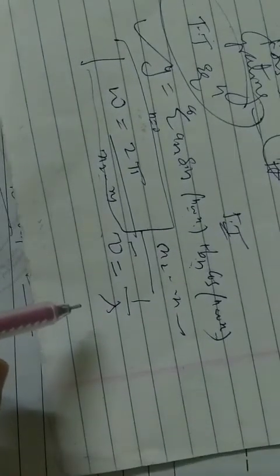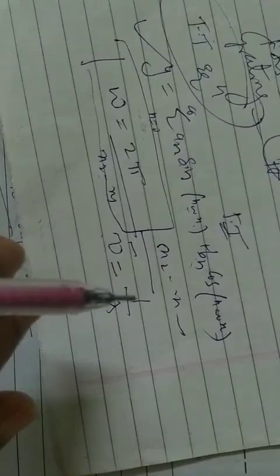So what is this omega? Omega is given by the formula 2 pi by x2 minus x1. Here x2 and x1 are the scale of the x-axis, which determines the resolution. Because we know that the wave number is nothing but 1 by lambda, so this is what we have to see in terms of wave number.